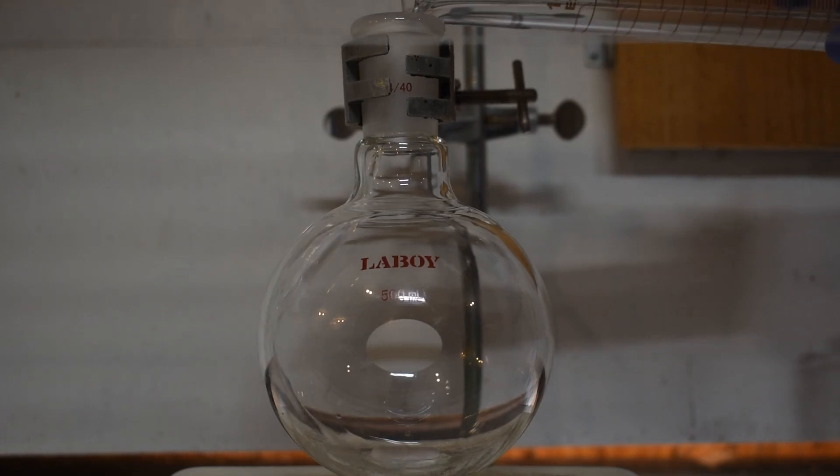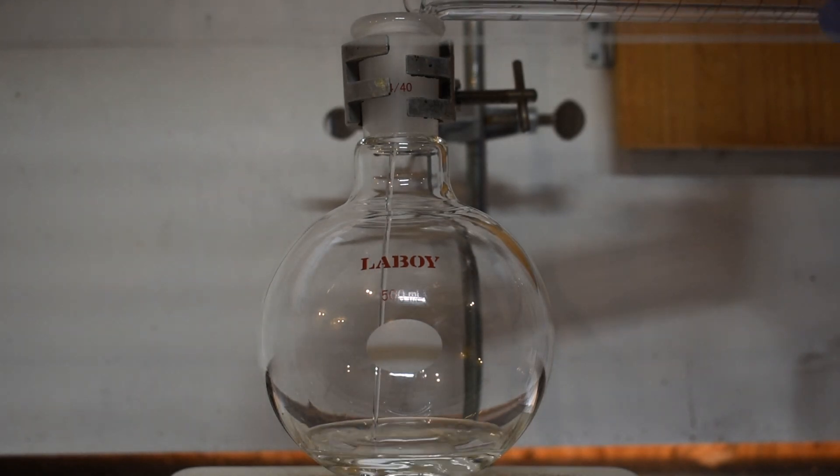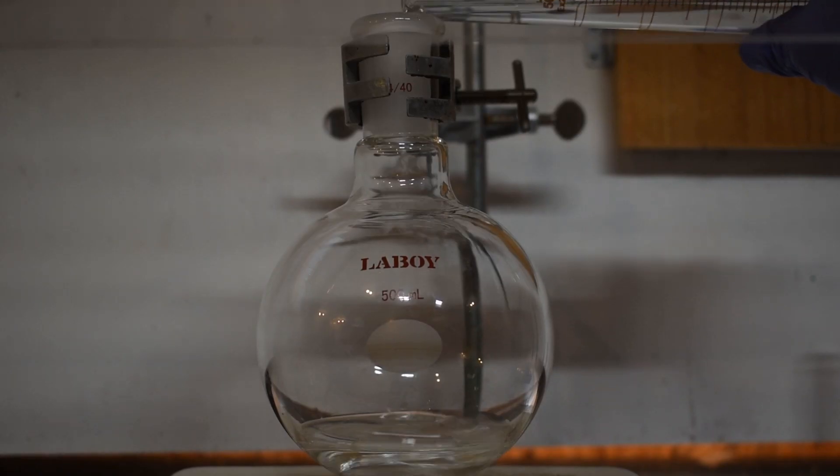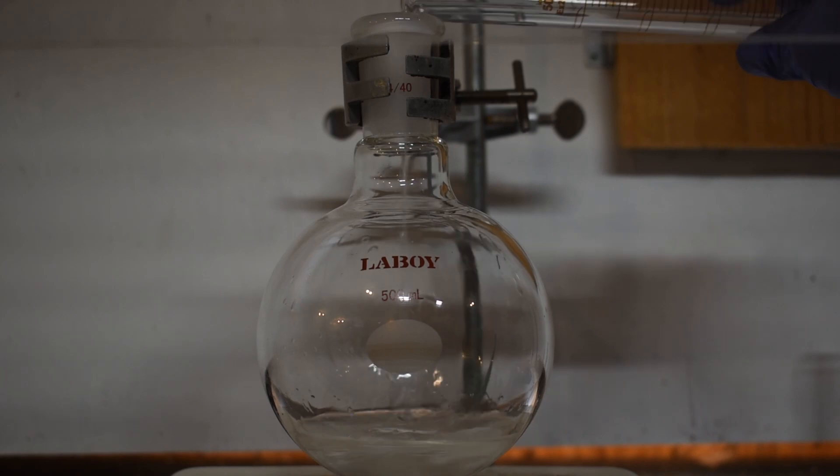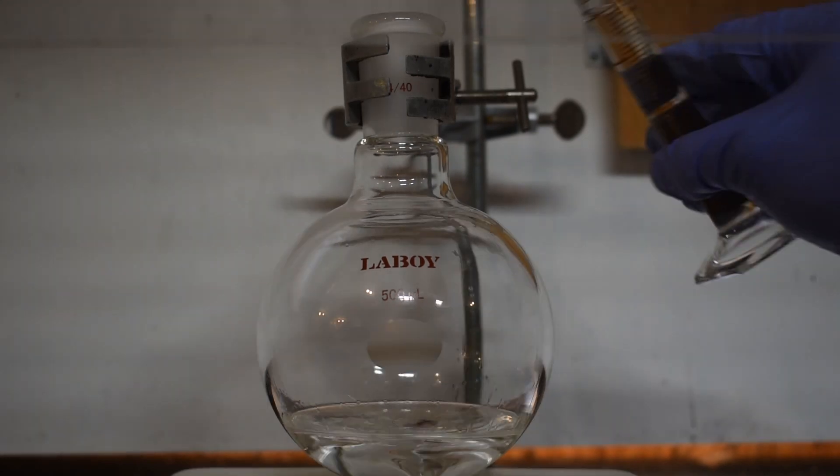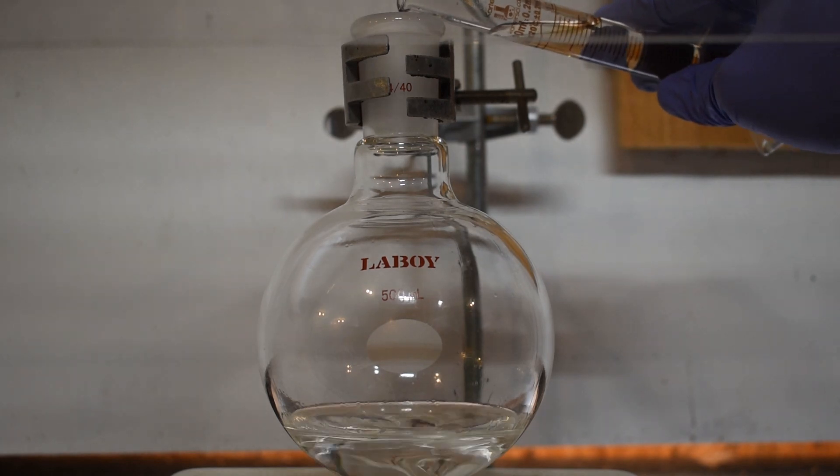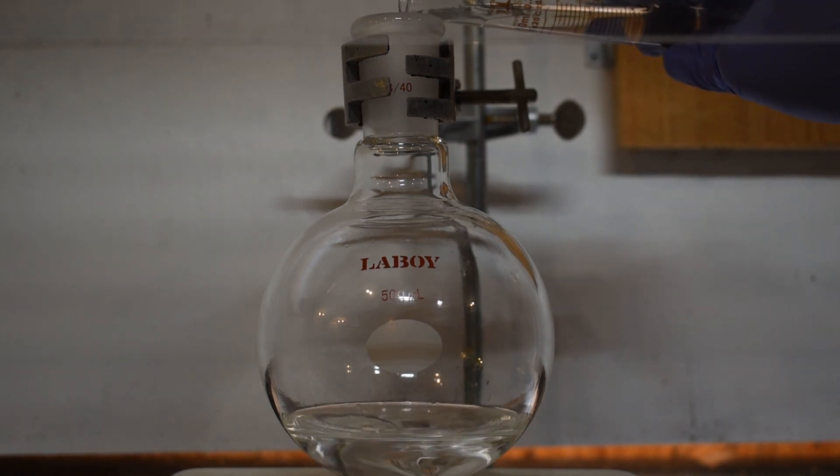To a 500 milliliter flask, I first added the isoamyl alcohol, and then on top of that, I added my glacial acetic acid. Finally, I slowly added my sulfuric acid to prevent the mixture from getting too hot.